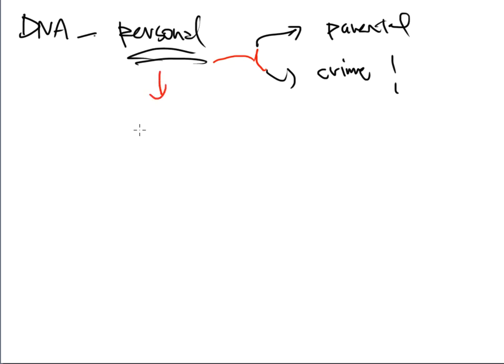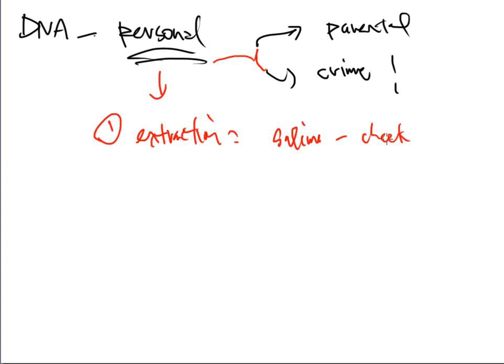So for this particular lab experiment, we are getting ready to undergo the process of, number one, extraction. This is normally what you're going to do on the very first day of lab with us. You're going to go into the lab and swish your mouth with some saline solution, which is just salt. That will help get your cheek cells all nice and burst open, because that's where the DNA is going to be held.